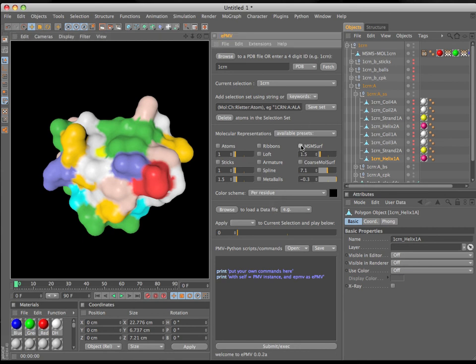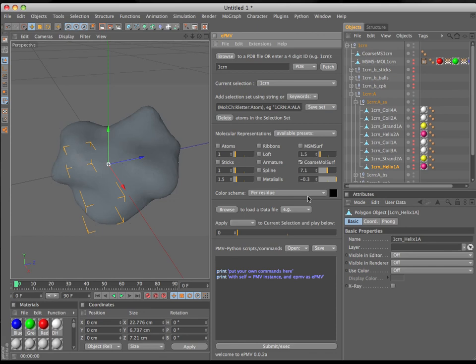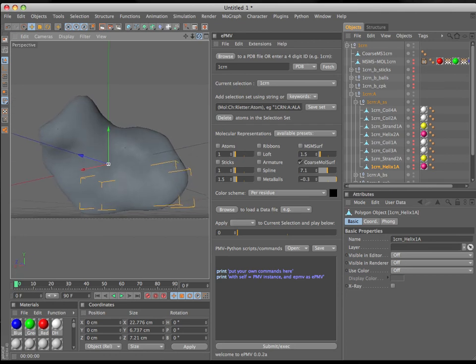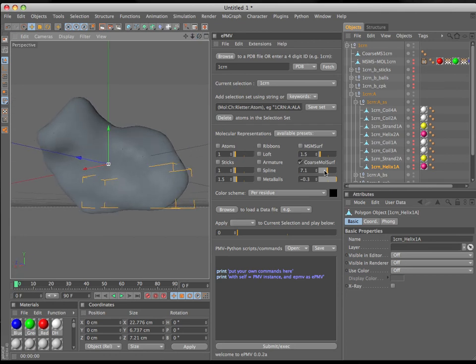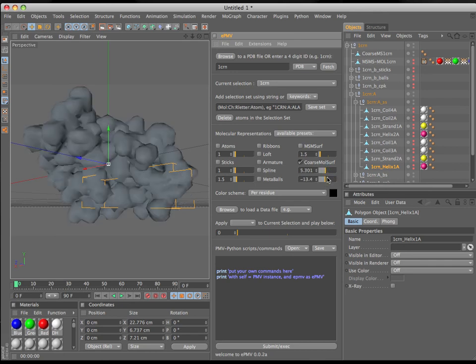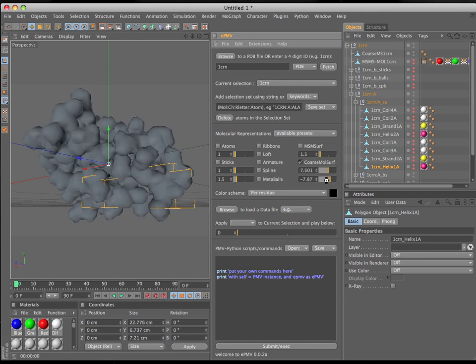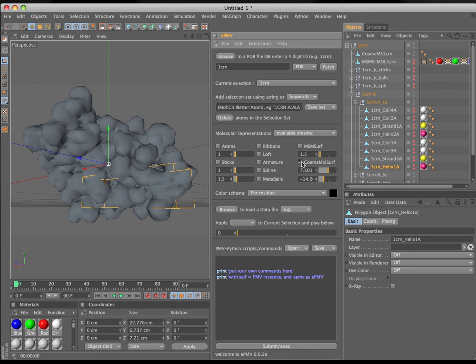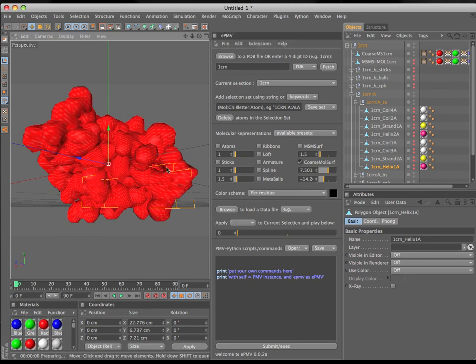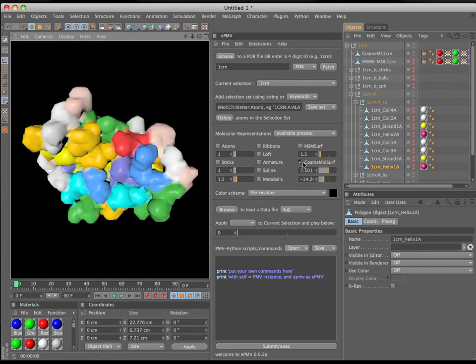I'll close the molecular surface and generate a coarse molecular surface. This is a nice smooth, simplified representation of the molecule. There are a couple of adjustments here that allow you to get different densities and different falloff values for the proteins, and it's really nice that Ludovic has set this up so you can adjust it in real time. We can also color this per residue, and it works on all the representations.